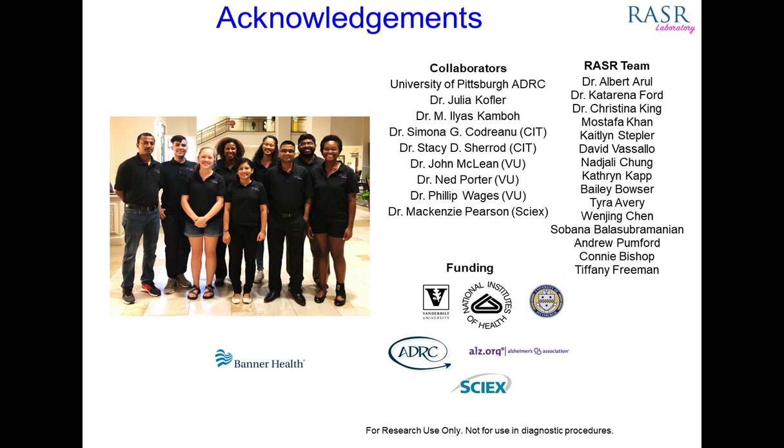So what's very critical about these experiments is that we really have to observe and isolate both our light and heavy precursors in order to get back robust reporter ion data. And so I think if only a single peak of the pair was selected in the Velos platform or in the Fusion, then we wouldn't have as much overlap between the techniques. And so certainly we've observed that with the Lumos, we're able to increase our sampling of light and heavy pairs, and so we get more comprehensive data with that platform.